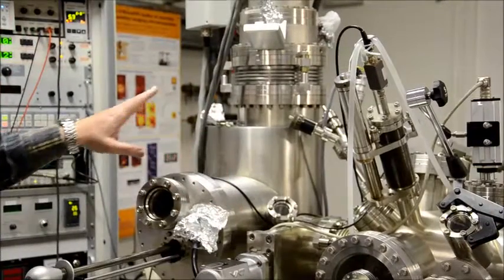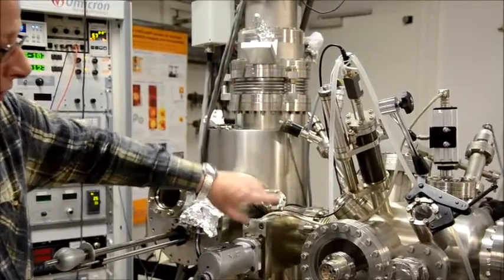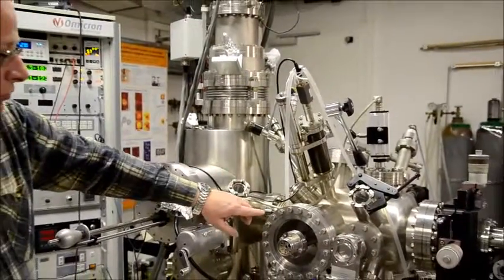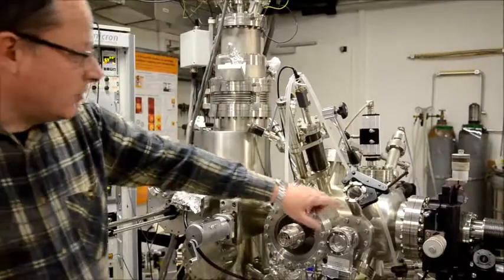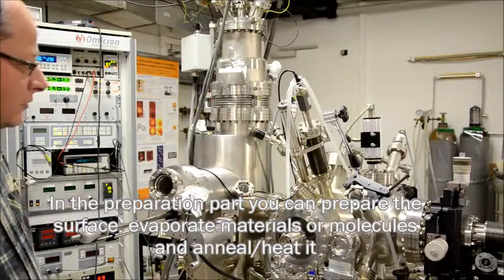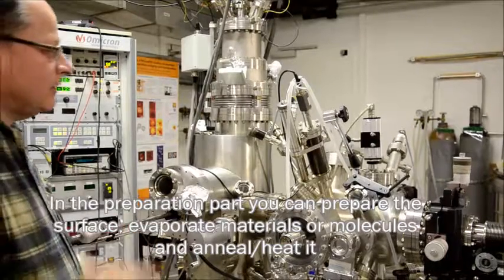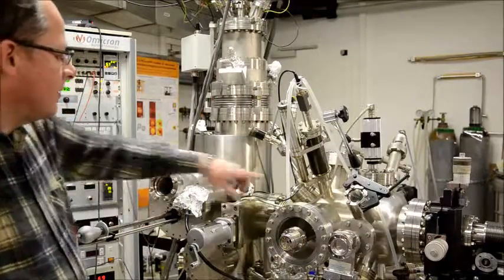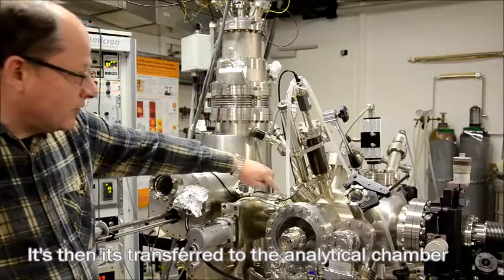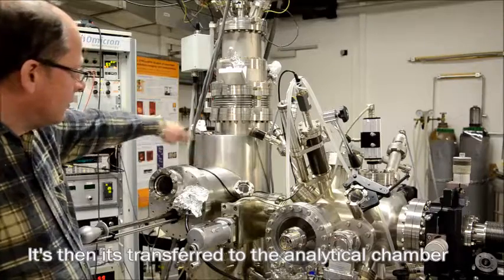Basically, the whole system here is a combination. On the right side here we have the preparation part. So here you can prepare the surface, you can evaporate some material, some molecules, you can anneal and heat it, and then if it's prepared, it's transferred with this transfer to the analytical chamber.